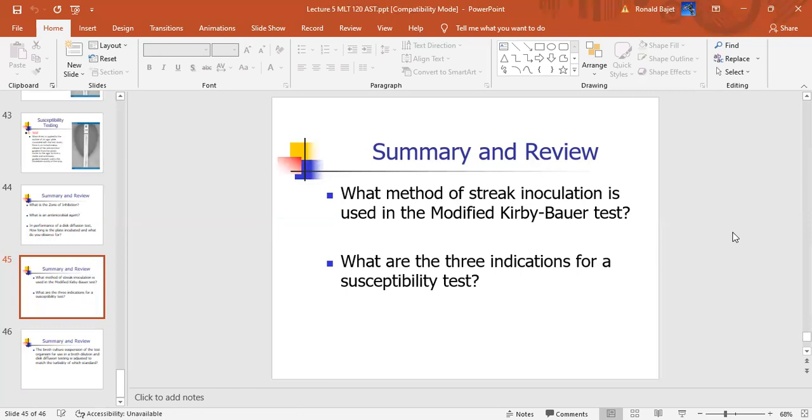Okay, staph species is not an obligate aerobe, it's a facultative anaerobe. That means it'll grow throughout the tube. It'll grow where there's minimal oxygen present. And on the OF tube, if you get an oxidizer that grows at the bottom, is that possible? No, that's correct. It's not possible because if it's an oxidizer, it'll grow at the top.